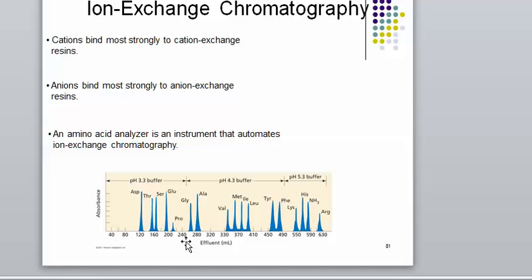The problem with the amino acid analyzers, however, is that they are very messy. If they spring a leak, well, you're going to get ninhydrin everywhere and everything begins to turn purple. So if you're working on an amino acid analyzer, you will look like a Smurf by the time you are done, and this is something that people just really don't find attractive. So there's the amino acid analyzer. Take a look at it. Very similar to IC.